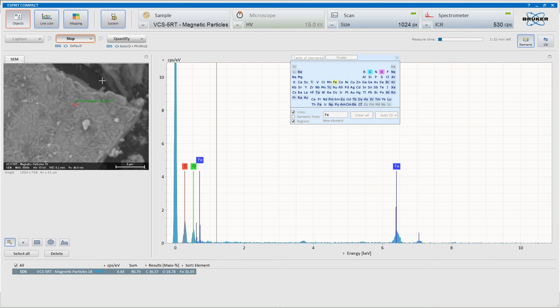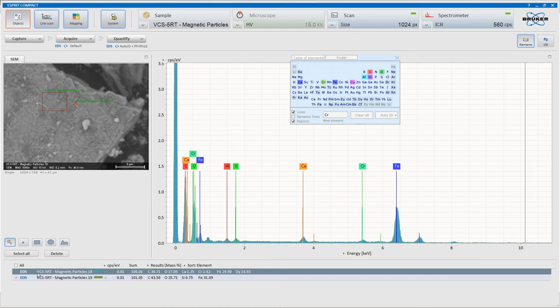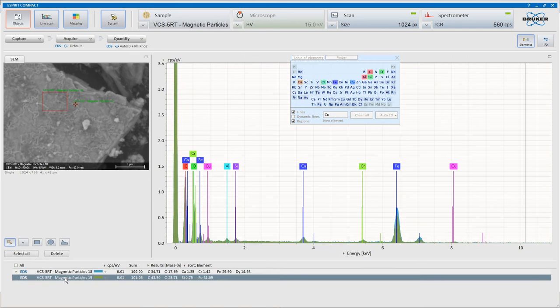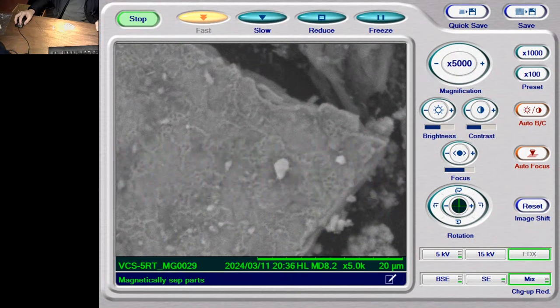It's the same material, mostly iron. Not a lot of samples because it's in shadow mostly. So a little bit of chromium, copper, aluminium, silicon, calcium, very little quantities here. Copper also in here. Where is that? Copper in there. Okay, so I think that is this sample of magnetically recovered material.